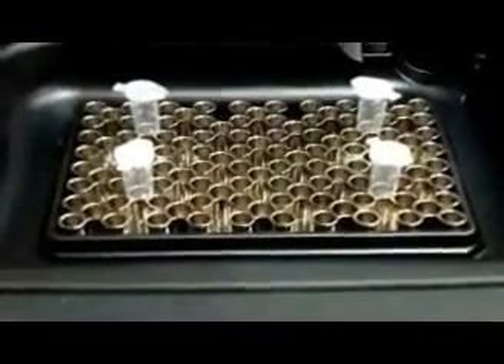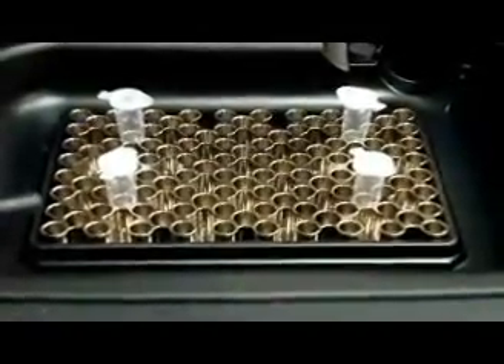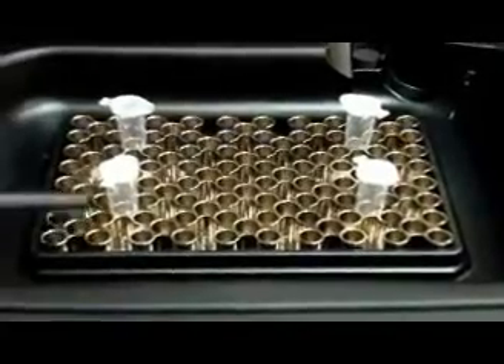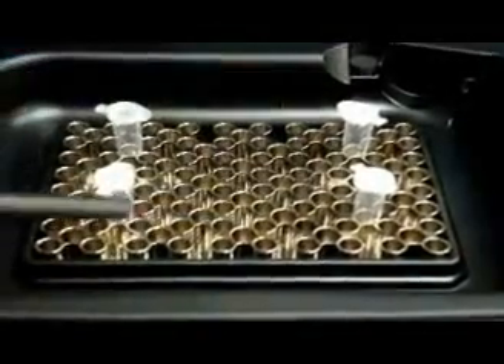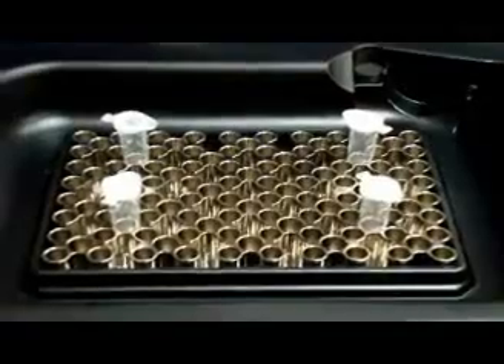Even though the combi block is designed to run multiple different tubes and strips, be sure to always use one size at a time. For example, these 0.5 tubes when running small quantities of samples should be balanced on your plate to prevent any damage to the automatic lid.